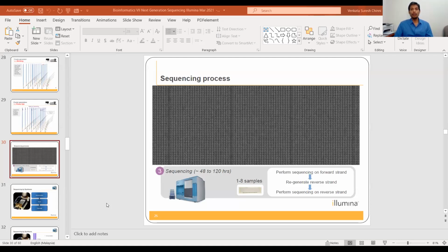And for that binding, the concentration of the DNA and the primers present was calculated in such a way that each DNA fragment will randomly bind a few hundred primers afar, it should not be very near. But random possibilities are there, no? There are some DNA fragments which can bind very nearby.